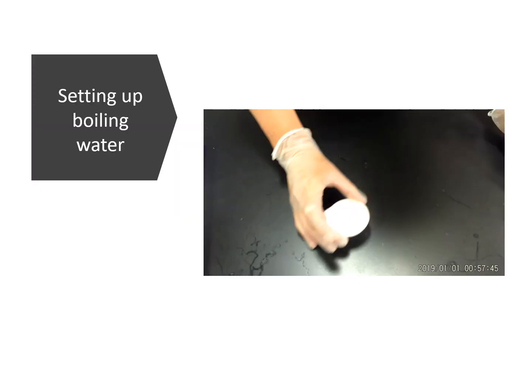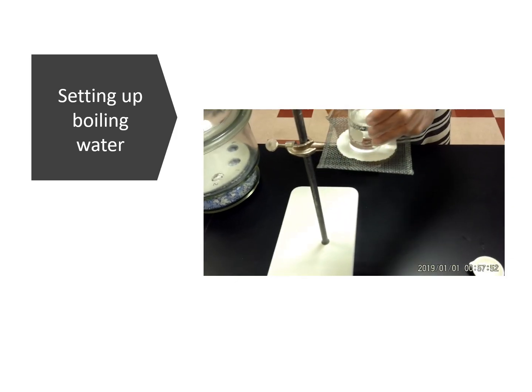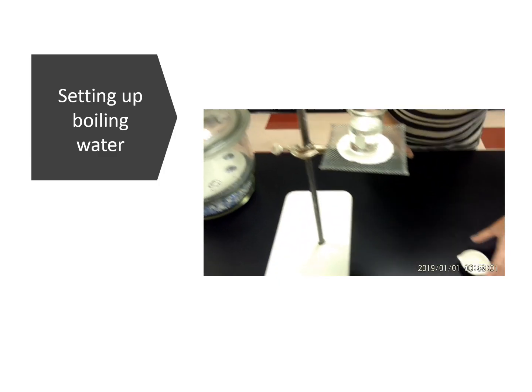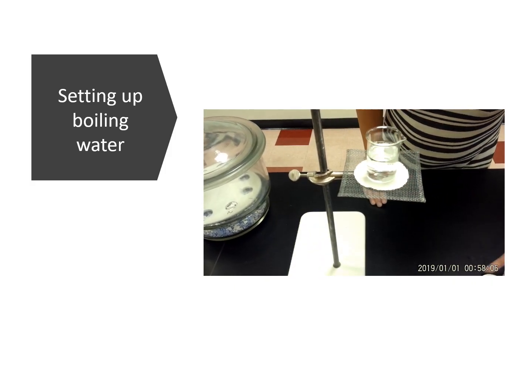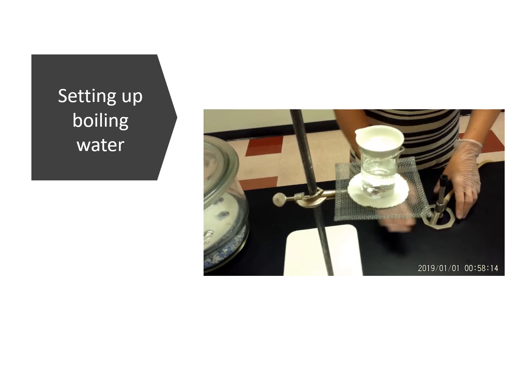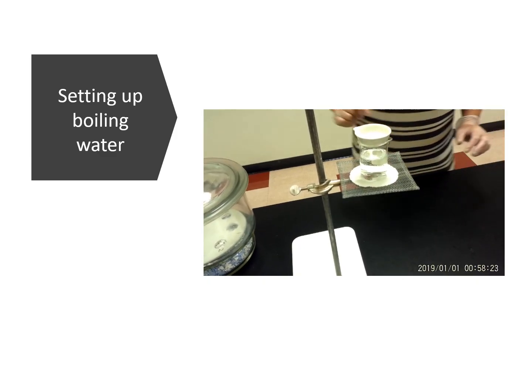Now let's go ahead and take a look at the setup. When you dehydrate your solution, you're going to set your Bunsen burner. You'll carefully balance it. Put your 100 ml of DI water here, and let me explain. When you put the spout right there, you're going to balance this right here, but make sure there's no watch glass. And when we adjust it and put our Bunsen burner, you're not going to have it at the hottest part of the flame of your Bunsen burner. What we're going to do is put it at a cooler part of the flame.